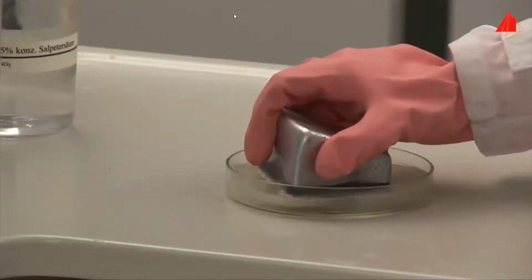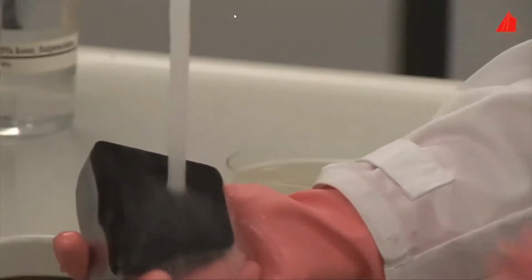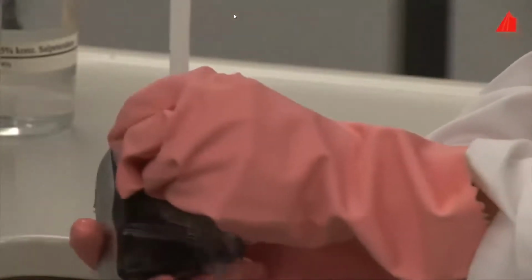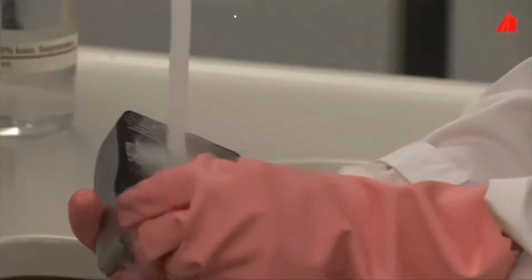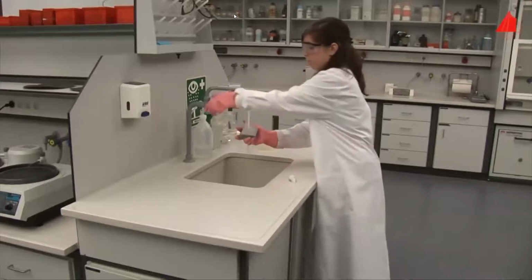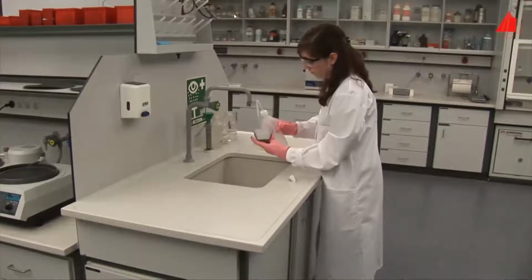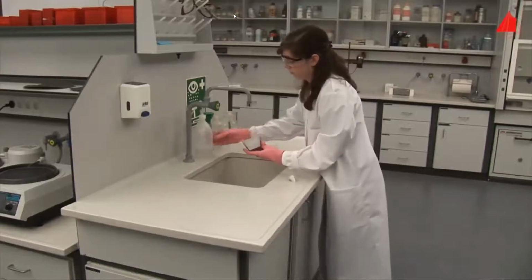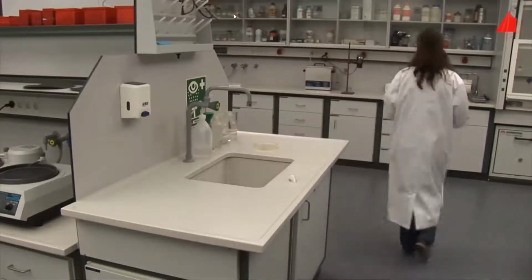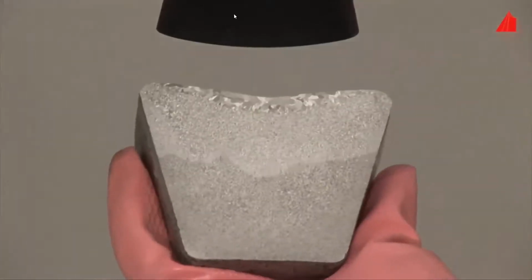After half a minute of contact time with the etchant, she washes the sample thoroughly with water and gently wipes off the grey coat of particles using cotton wool. In the last step, she rinses the clean surface with alcohol and lets it dry under a hairdryer. Now the specimen preparation is finished.